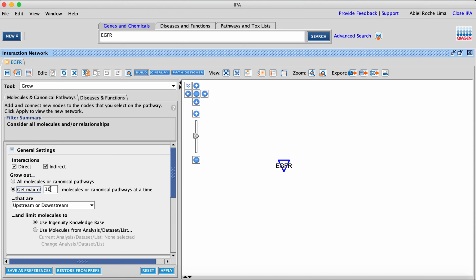Usually, you will end up with a small number of genes and proteins to work with, and that's why it's very important to study the analysis as we did in these sessions, to first do the statistical analysis and filter down, in the example that we provided for Lima, from 1884 proteins to at least 3, 4, or 10.